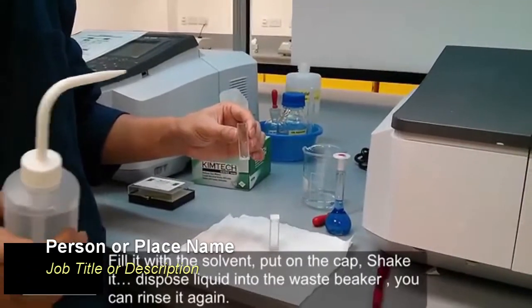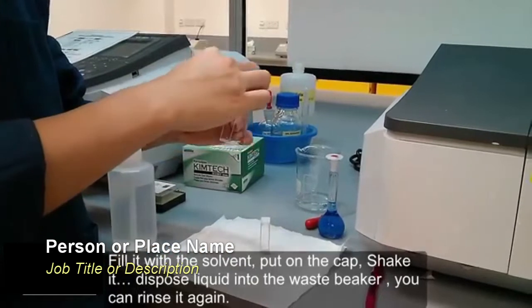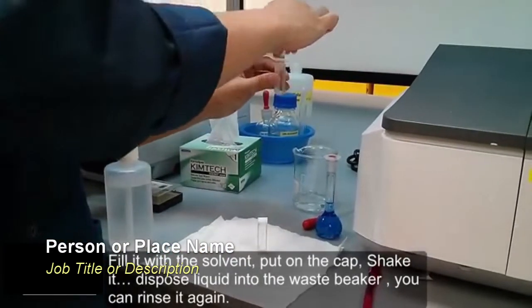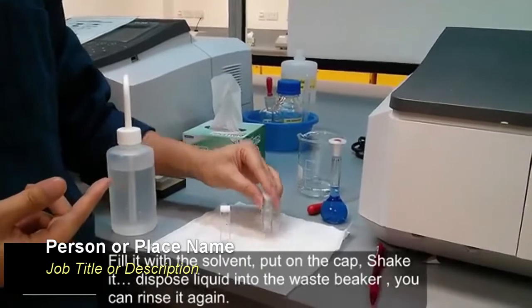Fill this with the solvent. Put on the cap. Shake it and dispose the liquid into the waste beaker. You can rinse it again.